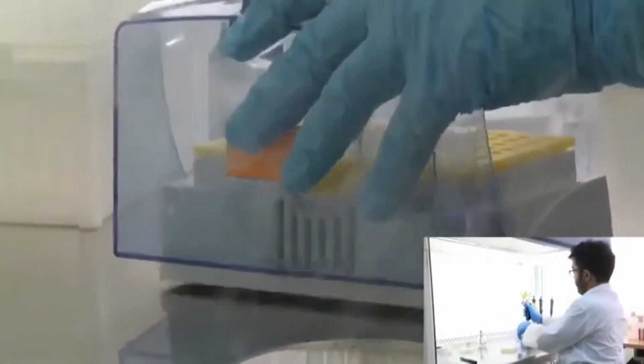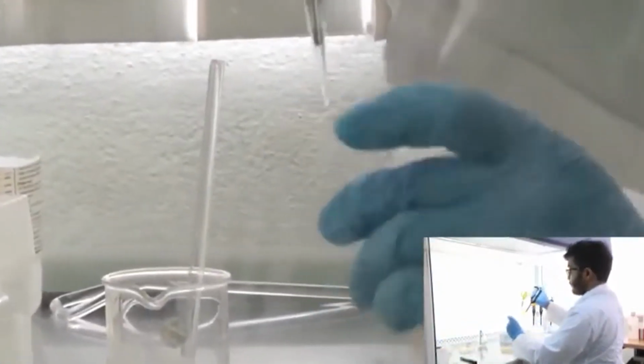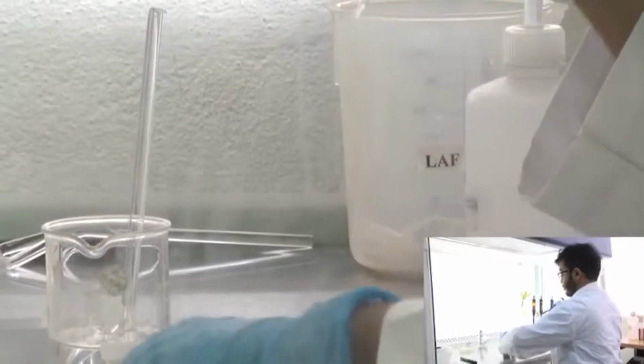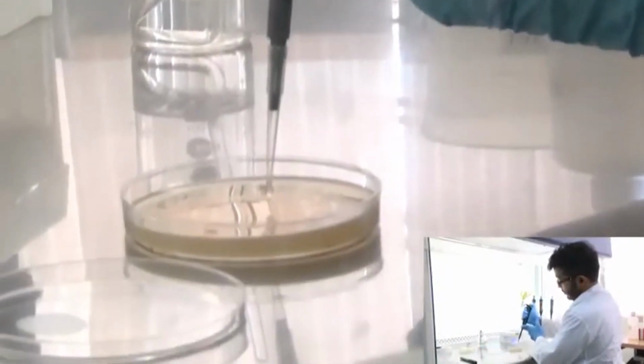Now what I am going to do is take 20 microliters of the culture and plate it on a different plate. I have labeled it as a 20 microliter plate. So I'll just take the culture, 20 microliters, and add it to the center of the plate.